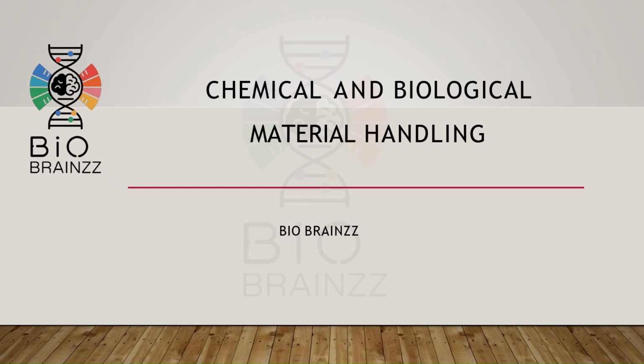In this video, we are going to discuss an important topic, that is chemical and biological material handling. In every laboratory environment, handling chemicals and biological samples safely is extremely important. Improper handling can lead to accidents, contamination, health hazards, and even damage to the environment. So, in this session, we will understand the correct handling procedures, safety practices, storage methods, and waste disposal systems followed in laboratories. Let's begin.